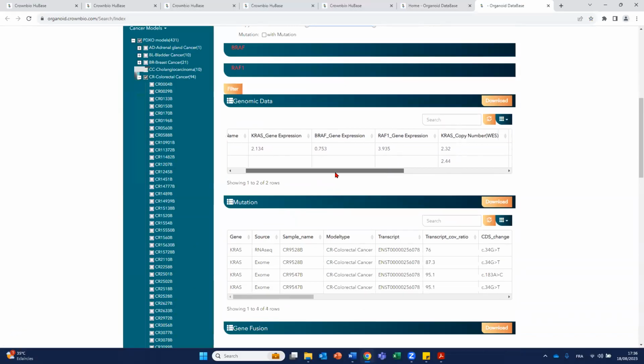And you can see here, we double check the G12C mutation. We find the same G12C mutation in both organoid models. So we maintain the mutation between the organoids and the PDX. So that's something that we almost always see for very important driver mutations. We maintain the very specific driver mutation between the organoids and the corresponding PDX. So that's something really robust if you want to pre-test something in vitro before going for in vivo testing.